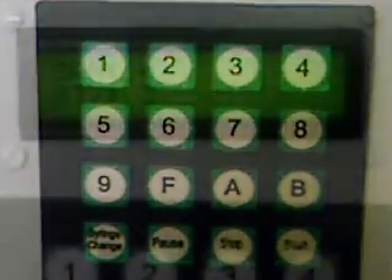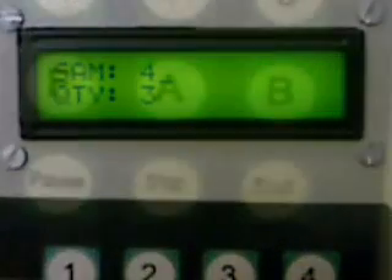A total of 12 such sequences can be pre-fed. Confirm the sequence on the display before pressing start again. The second instance of start begins the sequence processing.